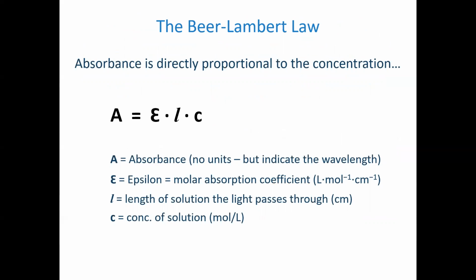And what it is saying is that absorbance and concentration are directly related. So notice the other two parameters. E is a constant, which is going to be different for every compound and temperature. And L is, we have those little cuvettes, right? Remember the cuvette, it kind of looks like, see if I can draw a square little test tube.